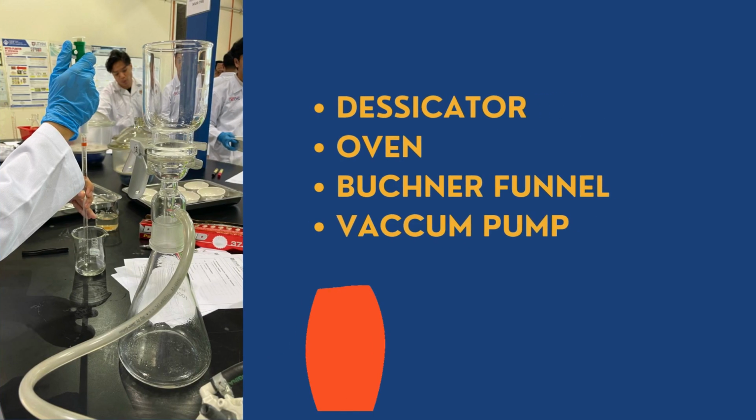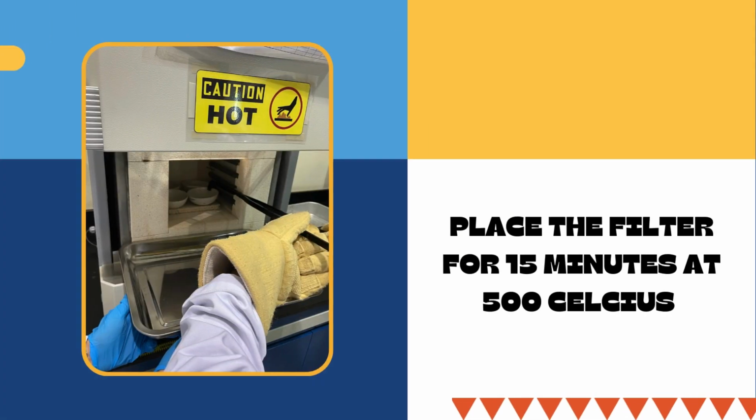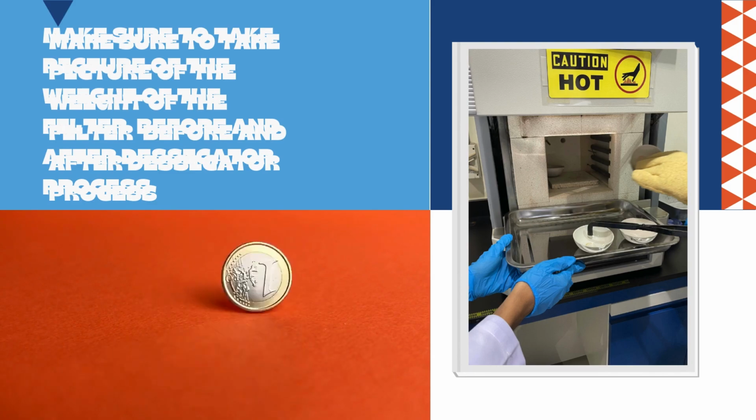In the total suspended solid and total dissolved solid experiment, solid refers to matter suspended or dissolved in water or wastewater. Solid analyses are important in the control of biological and physical wastewater treatment processes and for assessing compliance with regulatory agency wastewater effluent limitations. This experiment contributed to determining the weight of the suspended solids and dissolved solids in wastewater.